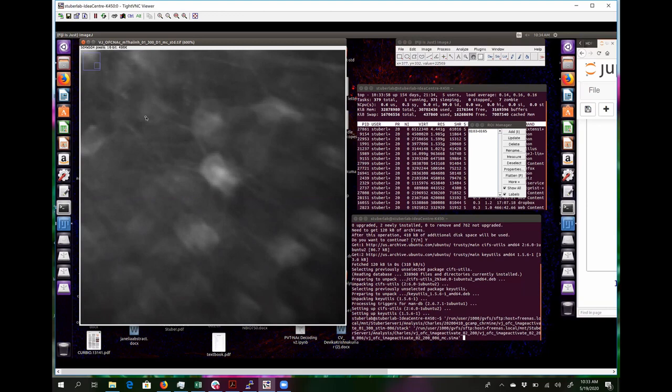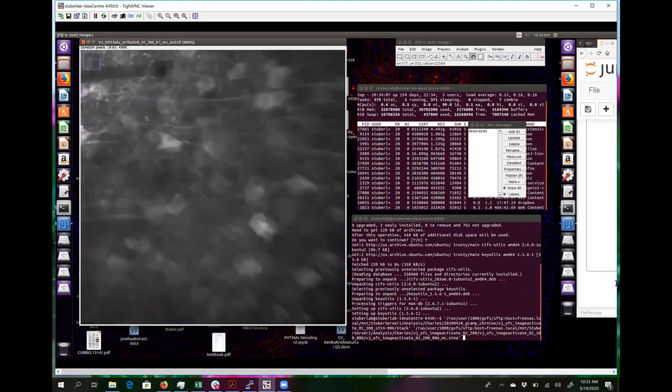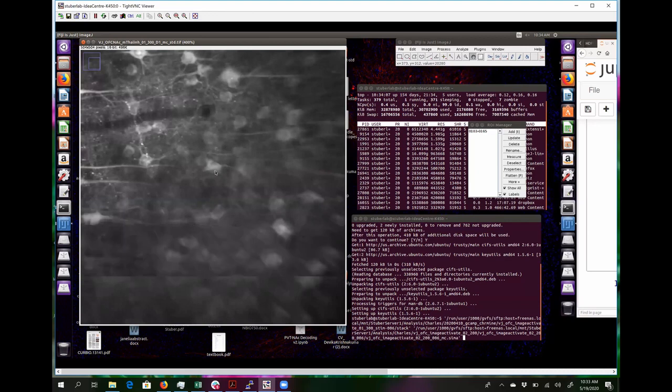Gotcha. So I think towards the complete edges, like with a 0.6 mm, this is much less true for 1 mm, but with a 0.6, if you're towards this edge, like here, your resolution is close-ish to just 1 photon imaging.